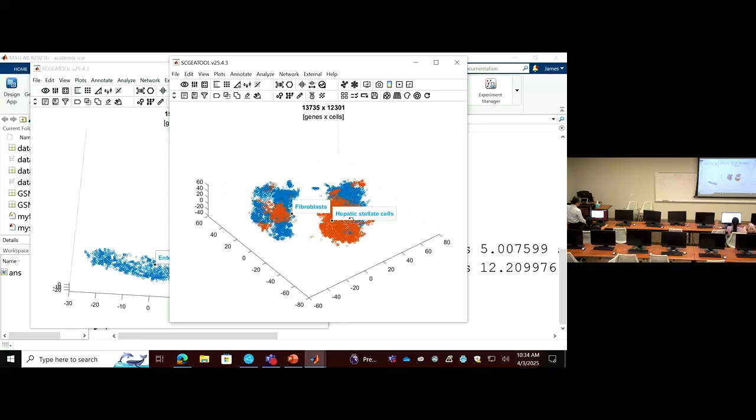Are you sure you're using the example download? Yeah, the one from Teams. Oh, from Teams. Okay. This one, right? Yeah. Good. How can I double make sure that? Yeah. You can check what cell type is in there. This one? Yeah. By label the cell type.